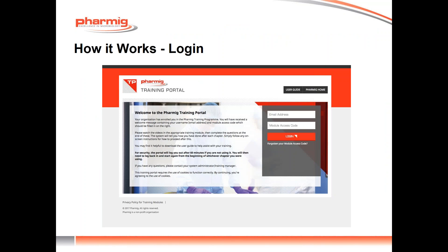This slide shows the home page of the portal. In keeping with GMP data integrity expectations, each user is required to enter a unique login and password in order to access the system. This practice is supported by user guides which are available to download from the site, and these outline clear instructions of how to set up and to run each module.